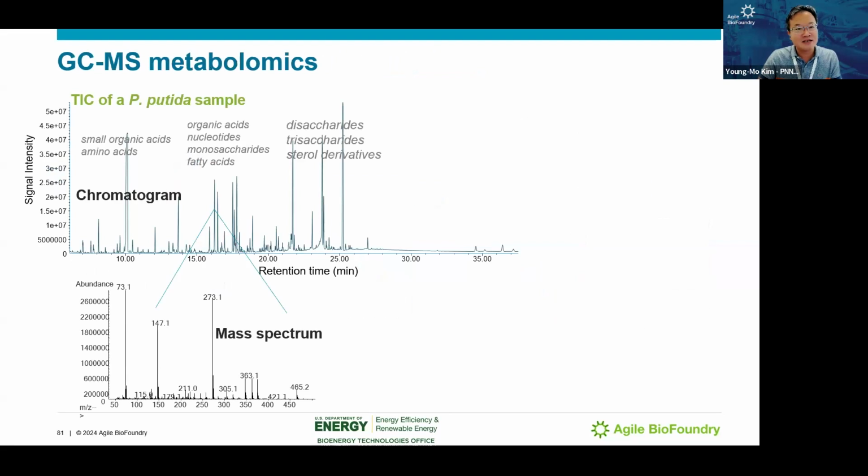On the GCMS side, we can get good separation over time. The top chromatogram is separation by time, and the bottom one is the mass spectrum at a given point. Small metabolites elute early, and bigger metabolites come late. Once we get the spectrum, we can search that information against our database.